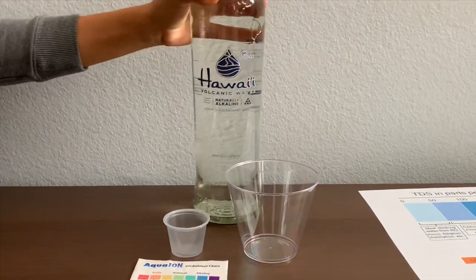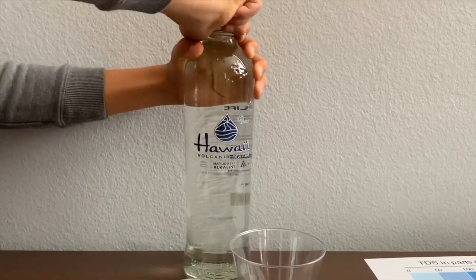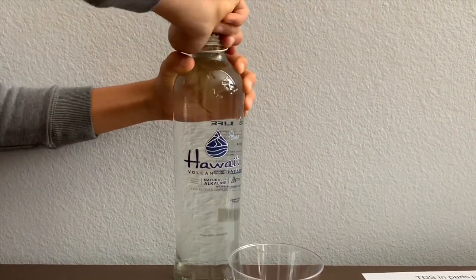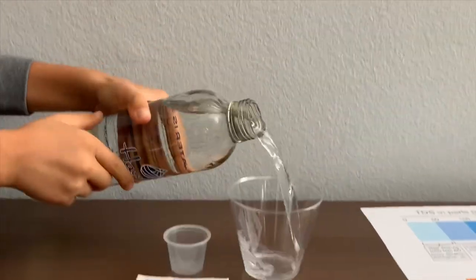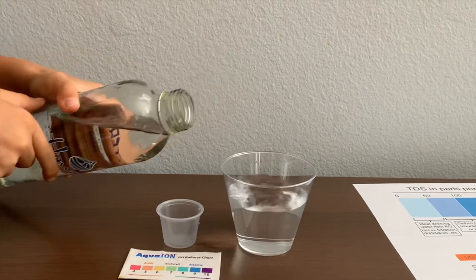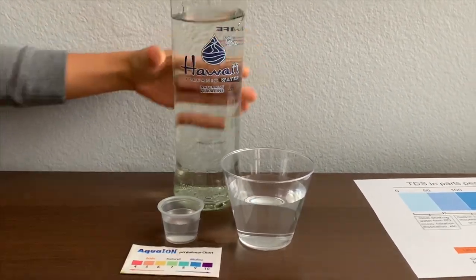Let's test the pH and the TDS. Let's pour some water in. First, we're going to test the TDS level.